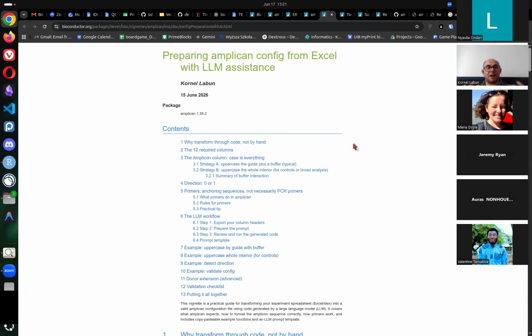Config file defines all parameters. It defines which sample contains which guides. It also contains which sample is a control, which sample has which primers, how to demultiplex each sample. So config is kind of like a single table where everything is defined.